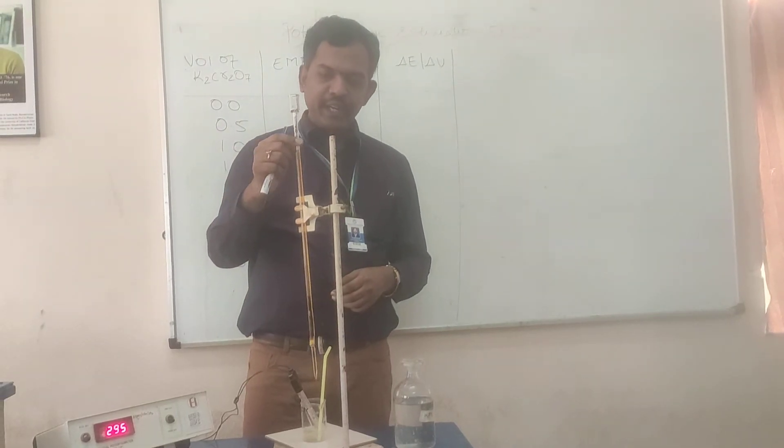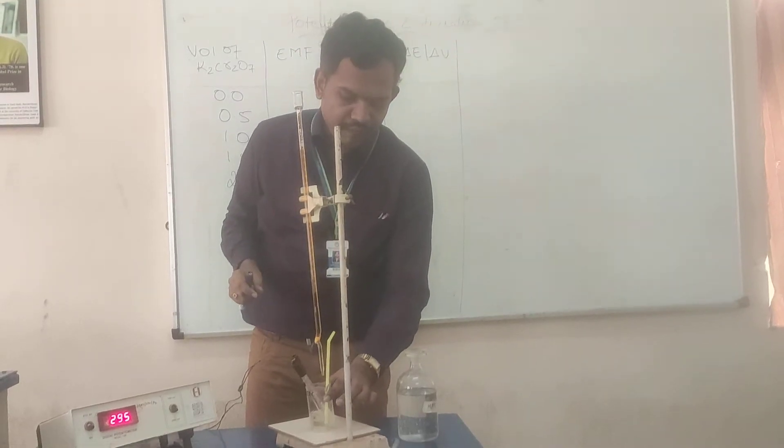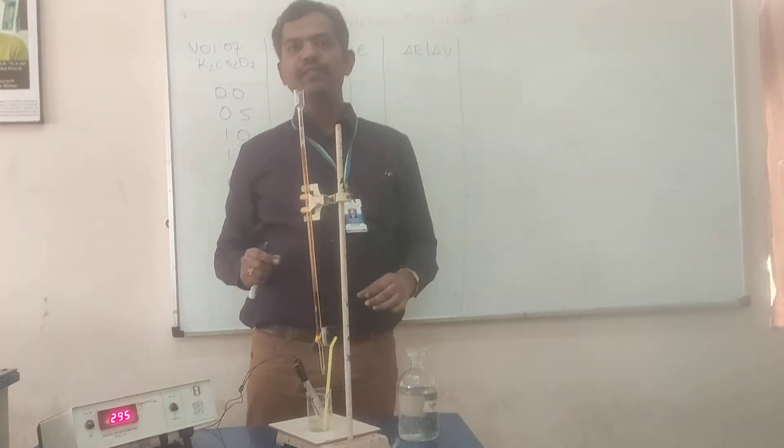So, we are going to take strong oxidizing agent potassium dichromate. In the beaker, we have taken reducing agent FAS, that is ferrous ammonium sulfate.